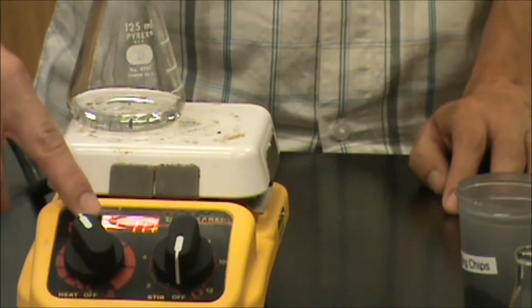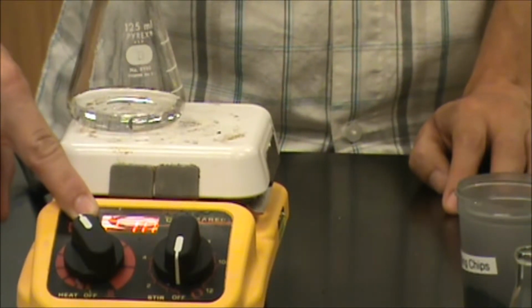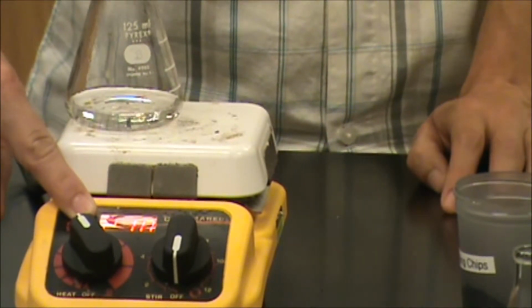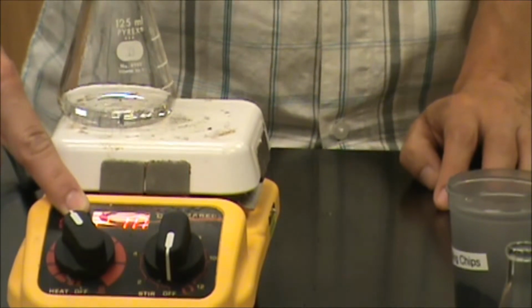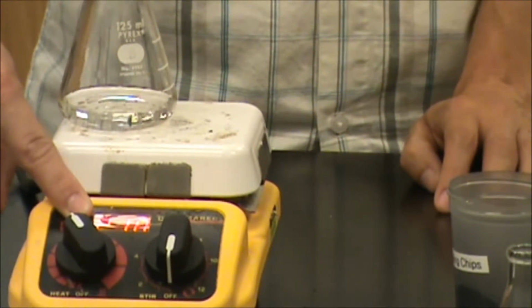You'll notice that these hot plates have numbers on the front of them. Unfortunately, these numbers don't have any real meaning. You want to ignore the numbers. Much like when you're cooking on a stove at home, you want to adjust the heat up or down in order to achieve the rate of heating which you desire. Our solvent is now hot, and we're ready to continue our experiment.